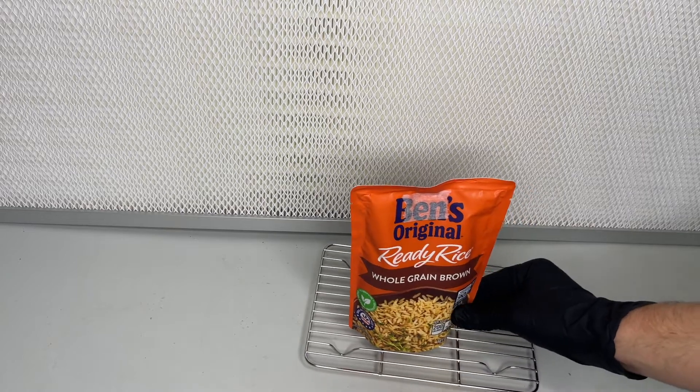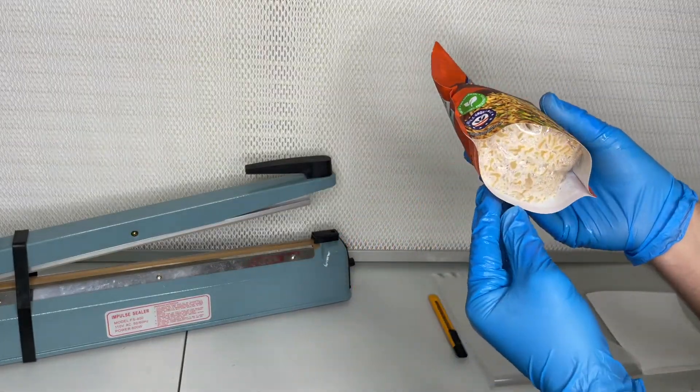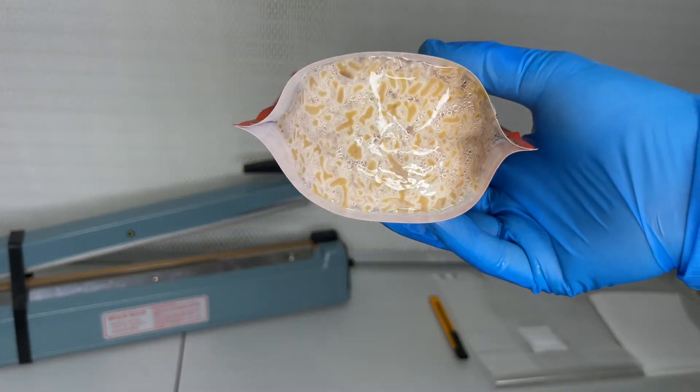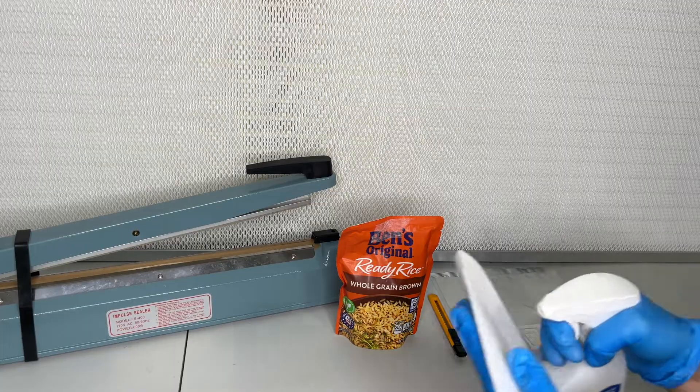Leave the bag in a room that is around 78 degrees Fahrenheit for about two weeks. You know the bag is ready once you feel that it is stiff and the bottom window shows the rice is fully colonized.